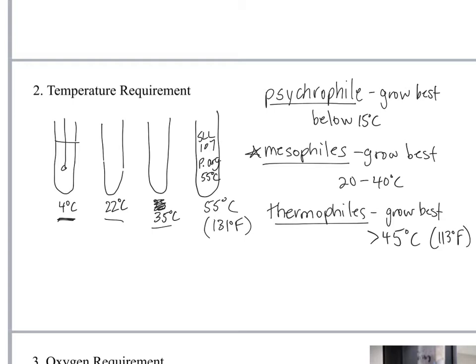They have found thermophiles growing in water heaters in homes. Okay, so, but again, they're not going to be pathogenic because that's above the temperature of our bodies. All right. So again, pay attention to your assigned organism for this part. It will be different than the first part of lab, and just inoculate those 4 tubes and get them in the right rack.